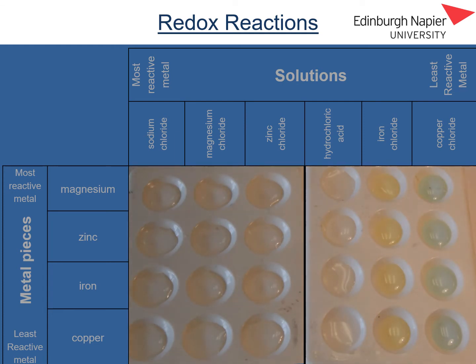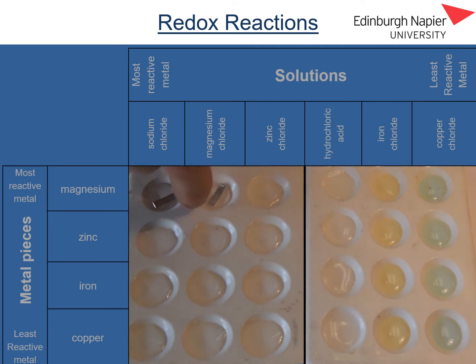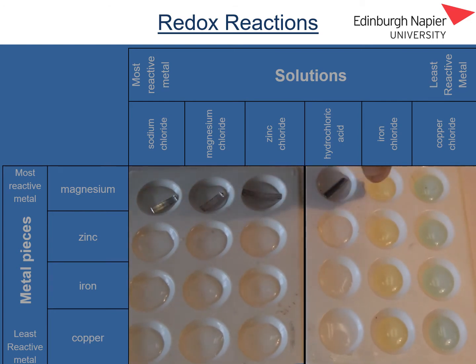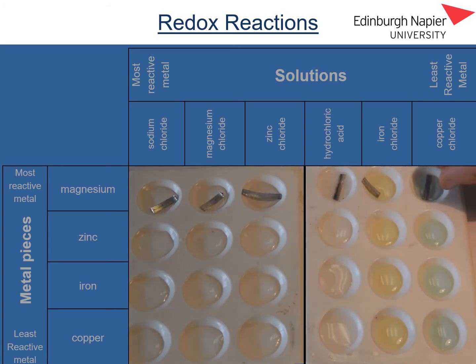To each of these solutions I'm going to add some metal. Along the top row I'm going to add a piece of magnesium metal to each of the solutions, looking to see if we can observe any reaction taking place. So I'm adding magnesium to the sodium chloride, magnesium chloride, zinc chloride, hydrochloric acid, iron chloride, and copper chloride solutions.